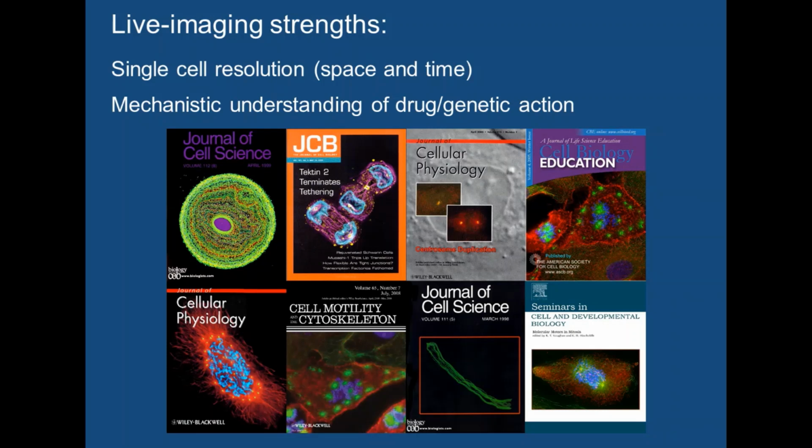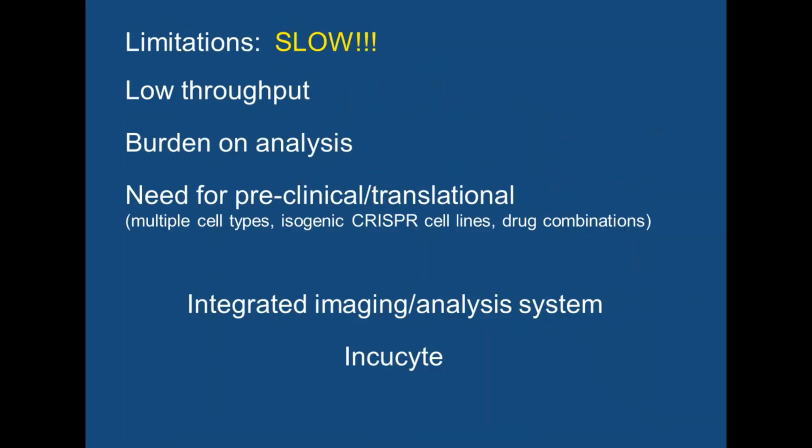And it gives us a mechanistic understanding of how various drugs and various genetic manipulations function on a particular cell treatment. But there are limitations to this approach. It's slow. This is a fairly low throughput system. There is a heavy burden on person hours for doing the analysis.